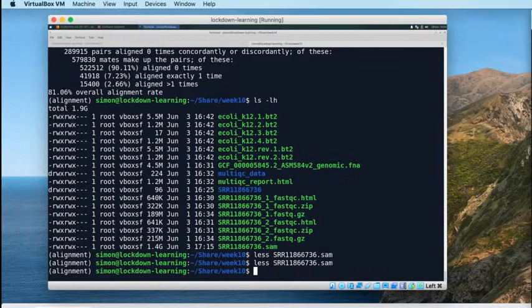But there are things about converting our SAM file to a BAM file instead which are advantageous, particularly the ability to index that BAM file and therefore explore it much more rapidly. So that's why we're going to look at SAMTools today. It's the primary reason why we're going to look at SAMTools. It's also an extremely useful piece of software for an awful lot of other things besides.